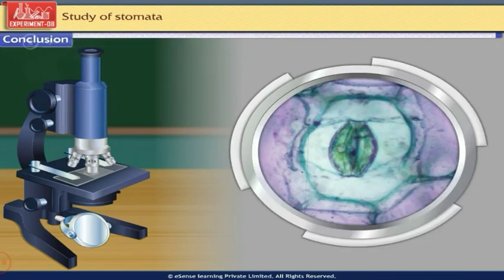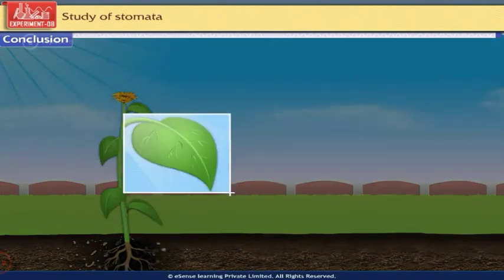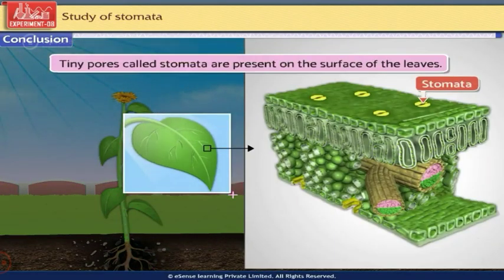Conclusion: Thus, after observing the temporary mount of leaf peel under the compound microscope, we can conclude that tiny pores called stomata are present on the surface of the leaves.